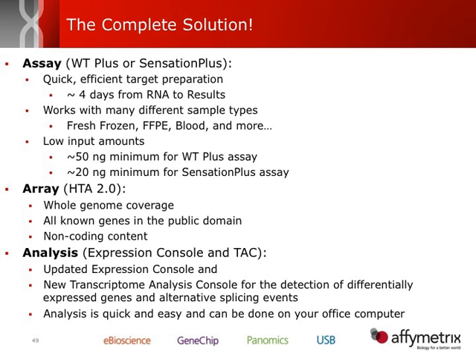So you can keep your precious samples, generate your results on the HTA, and then validate with that same sample type. So you're not using all of your sample just in the initial data generation. So that's piece one. Piece one is the assay.